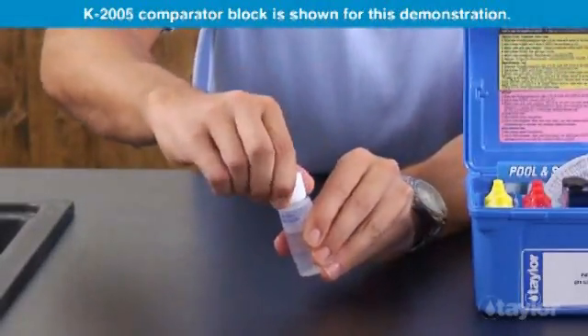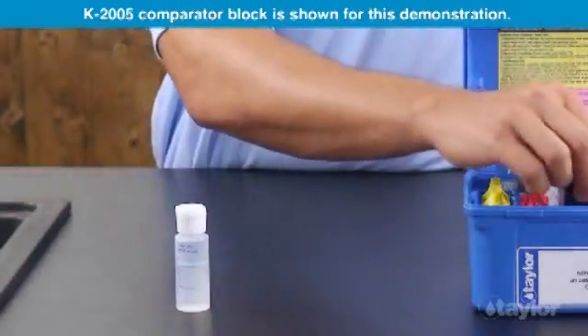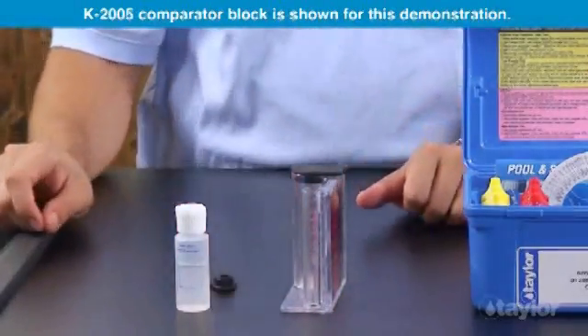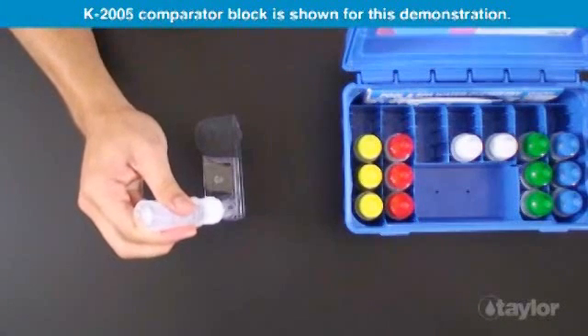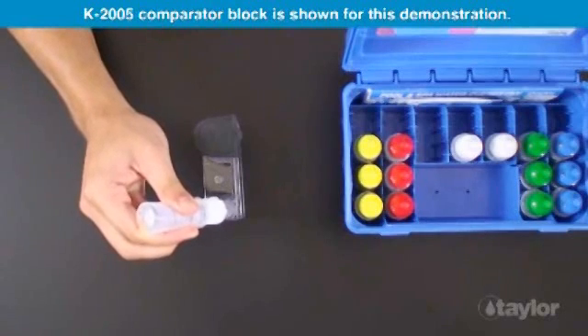Cap and mix for 30 seconds. Slowly transfer the cloudy solution to the small comparator tube until the black dot on the bottom just disappears when viewed from the top.